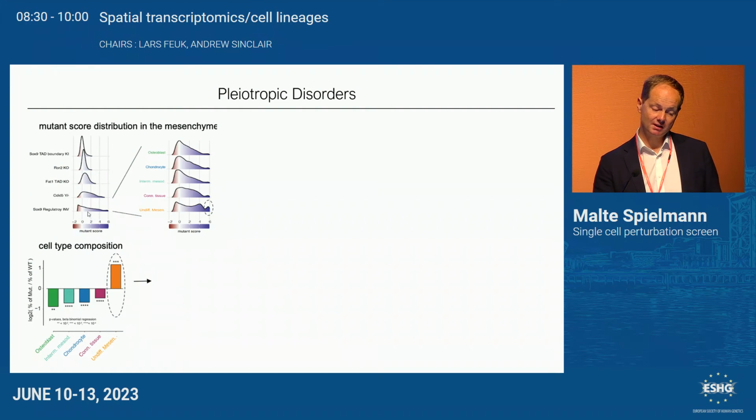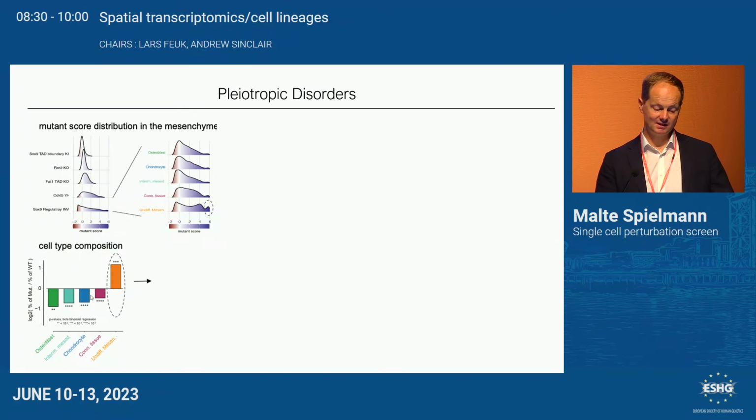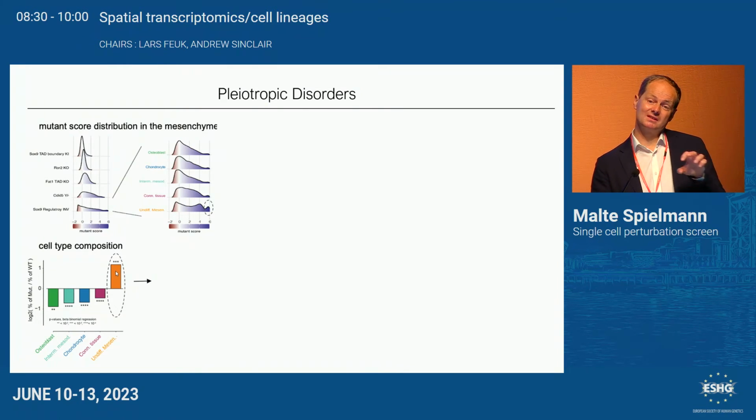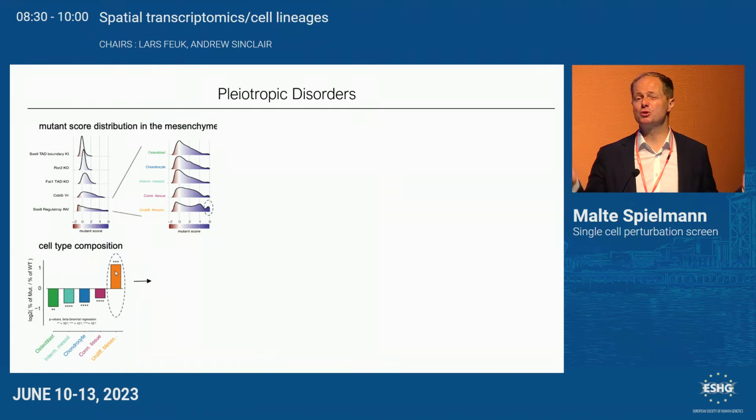So now you can tell the computer, please zoom in, which cell types are really affected. And it turned out that all the bone cell types were decreased, so osteoblasts, chondrocytes. You can see that here in this visualization. All the mature bone cell types were decreased, but an undifferentiated mesenchyme precursor cell type was massively enriched. So that sounded like maybe these cell types are developed, but they stall, so they don't develop any further. So really a developmental delay, but how would you prove this?